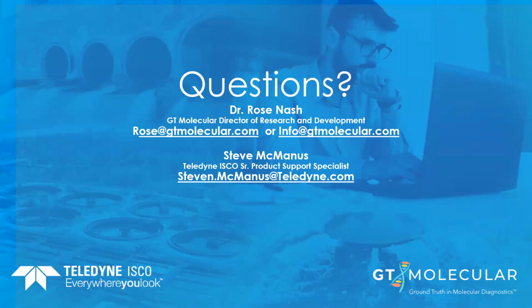Either you're going to have very little sample because we didn't have a lot of flow, or we're going to have too much sample and the sampler bottle will be full well before the end of the 24-hour period. That is where time-paced programming becomes more advantageous, because it guarantees that we're going to be able to collect sample from that location over that full 24 hours.